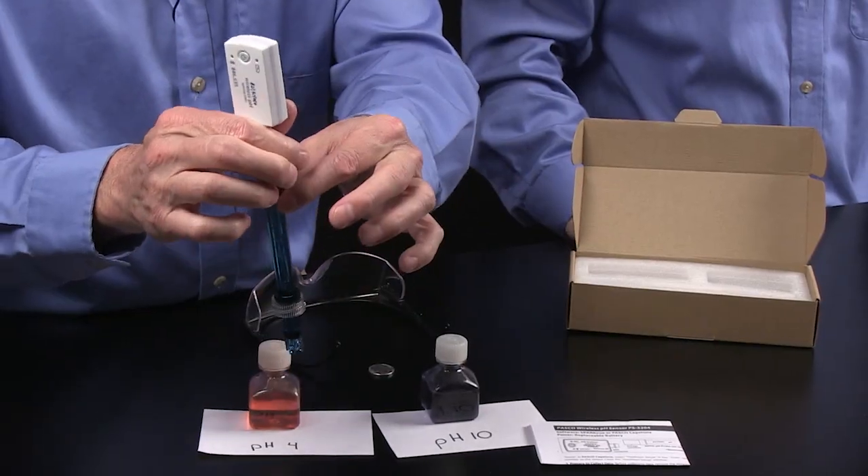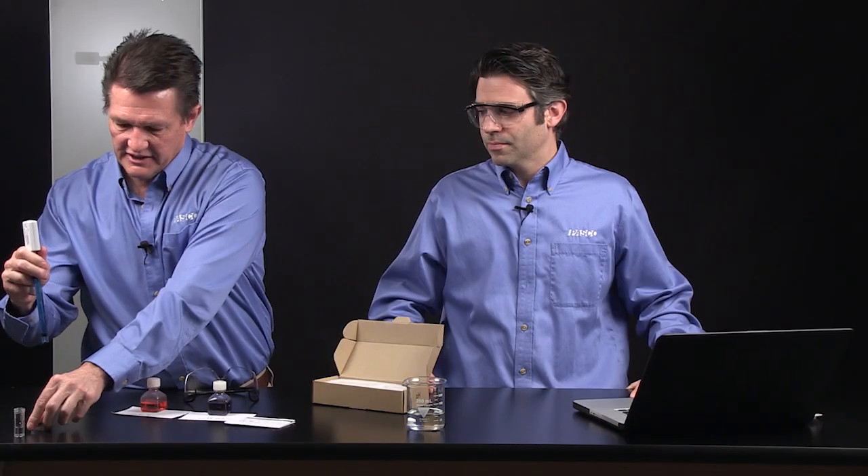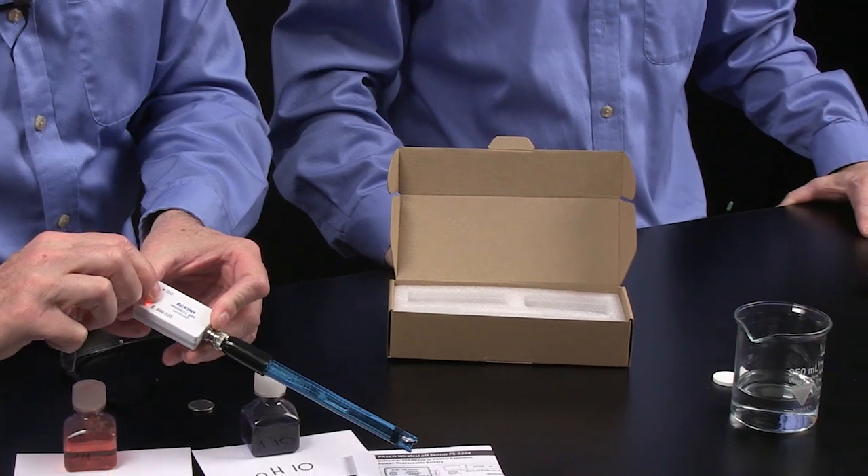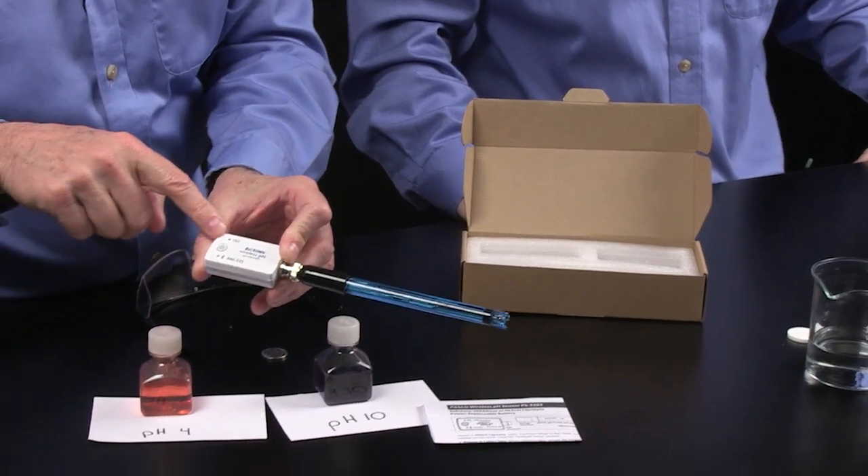The top cap we can either slide all the way off or simply take it off — I like to take it off. And that's the pH sensor. I'm going to turn it on, and I know it's on when I see the red flashing light.